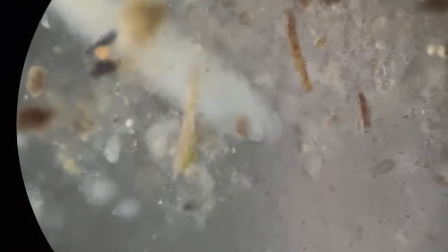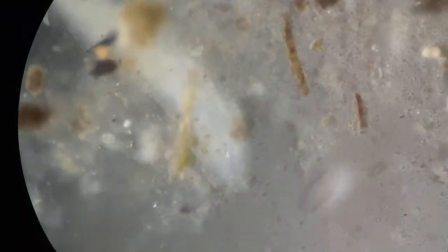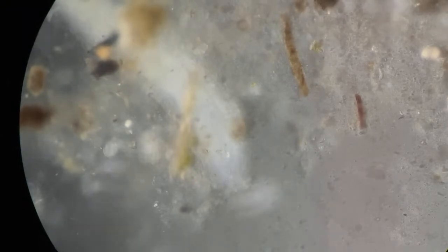I think I shall move the camera lightly. No, I shouldn't. Let it be. So we go back to the tick. Where was it?